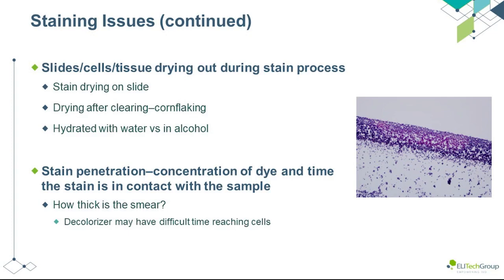There may be some cases where characteristics of the sample must be compatible with the stain protocol, such as in a thick smear. Here is a photo of a gram stain in which the thick section of the smear is falsely colored pink instead of purple. This can occur in thick areas because stains and other decolorizers and rinsing solutions may require more time to take effect on multi-layered smears. Timing of staining protocols may need to be adjusted for these thick smears.